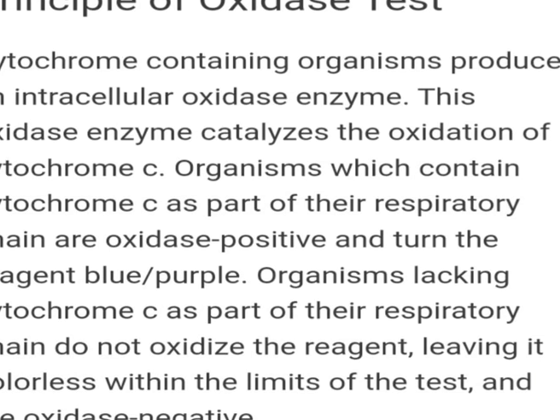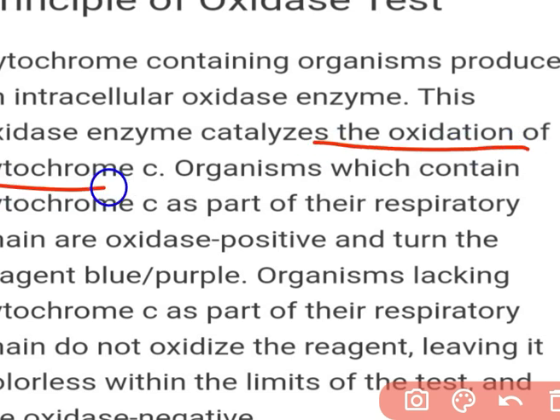The principle of oxidase test: the cytochrome containing organism produce a intracellular oxidase enzyme. This oxidase enzyme catalyzes the oxidation of cytochrome C. The cytochrome C is one of the important carrier molecule in a electron transport chain.